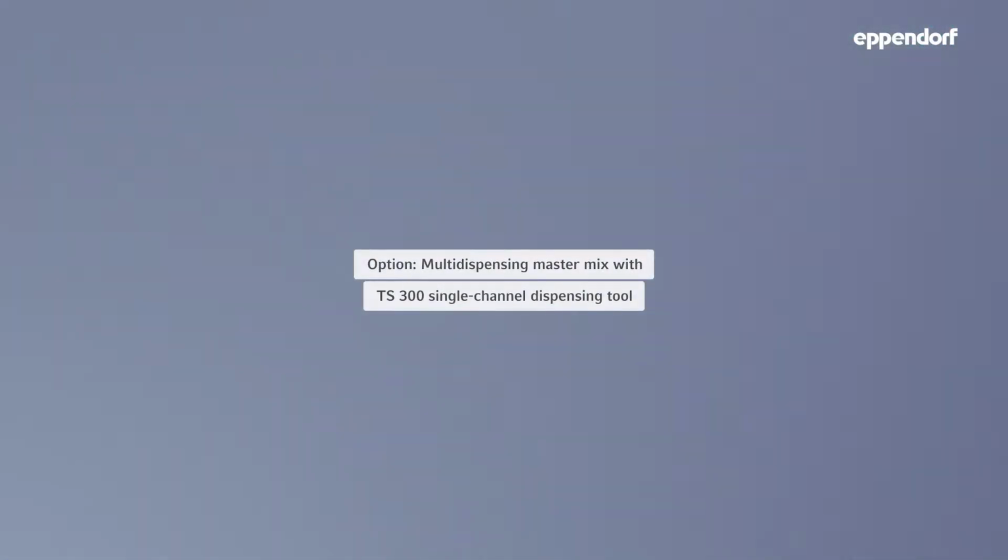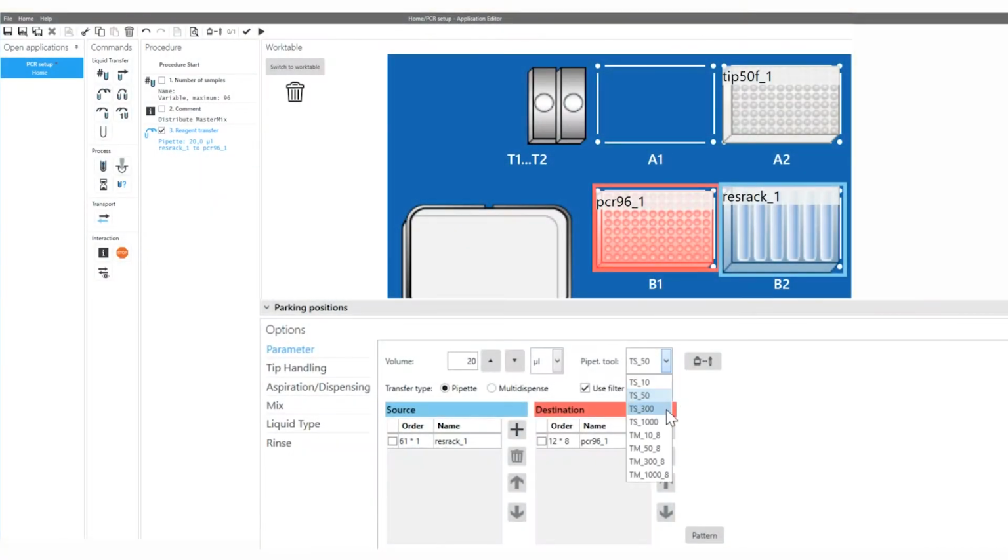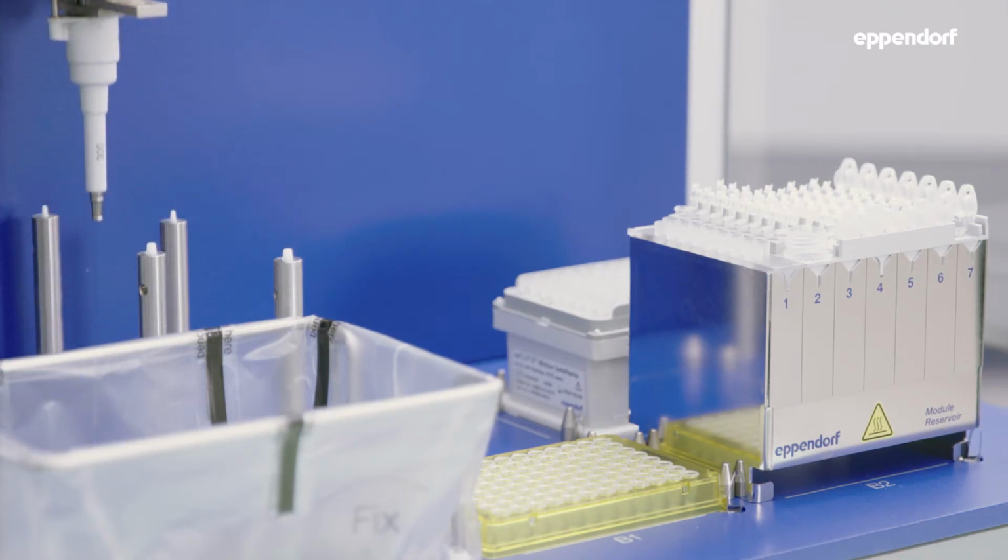To speed up the distribution of the master mix, you have the option to use a single-channel 300 microliter tool with multi-dispense mode. You can easily adapt your previously defined protocol just by changing the pipetting tool and transfer type in the liquid transfer command.